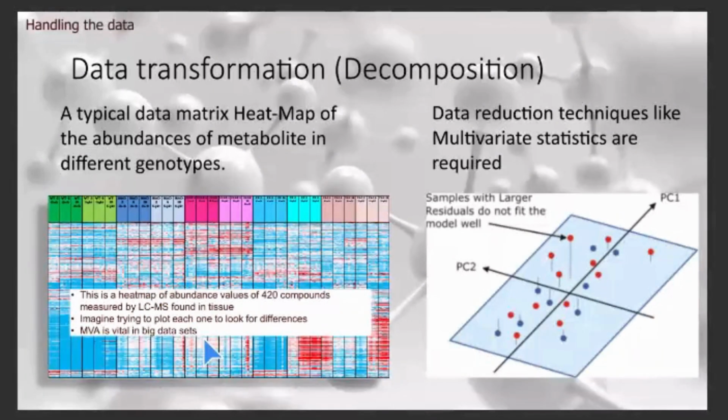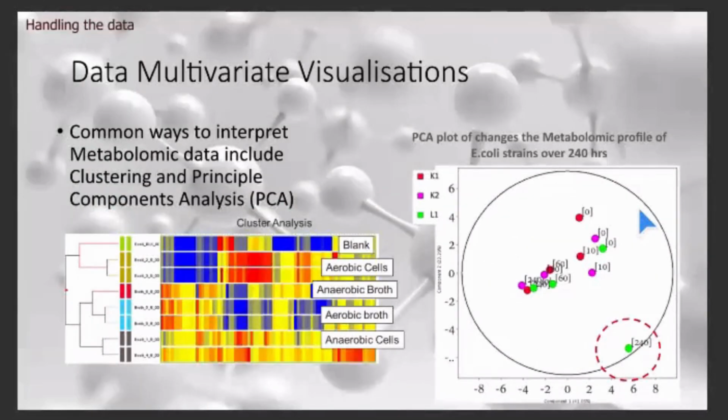But essentially what you're trying to do in something like, let's say, a principal component analysis, is to consider that we've got multiple dimensions, hyperdimensions of data here. We can't see or understand that because we only live in a three-dimensional world, but mathematics is capable of doing calculations within multiple, even infinite, dimensions. And something like principal component analysis essentially does what you might do with just a hand regression of a line if you're plotting x against y. It tries to plot what are called eigenvectors through your data in different ways that can then be more tractably visually displayed, such as in these examples here.